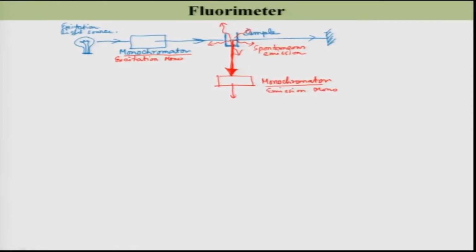So, now this is guided to the detector. I am going to have this detector over here, similar to the detector I discussed in the spectrophotometer. In general it is like a PMT, which detects the intensity just by converting the photon to a photoelectron and then measuring either the current or the voltage across a resistance. So, it determines the intensity of each individual wavelength that is created in the monochromator.